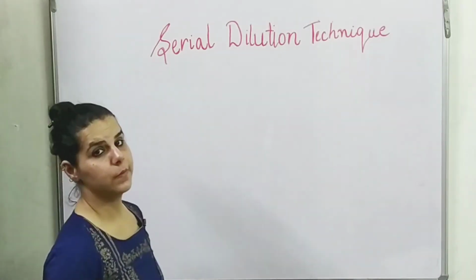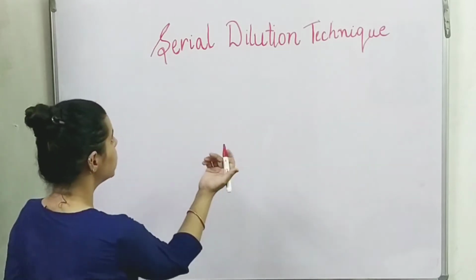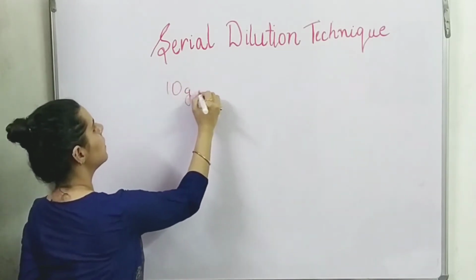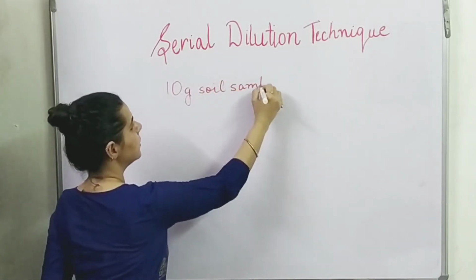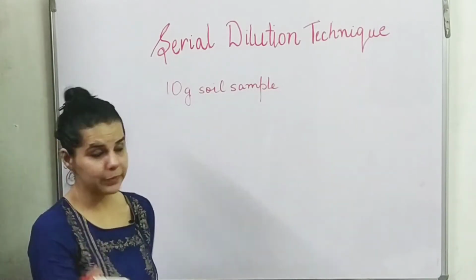So now, let us take an example of a soil sample, right? What I am going to do is take 10 gram of soil sample.